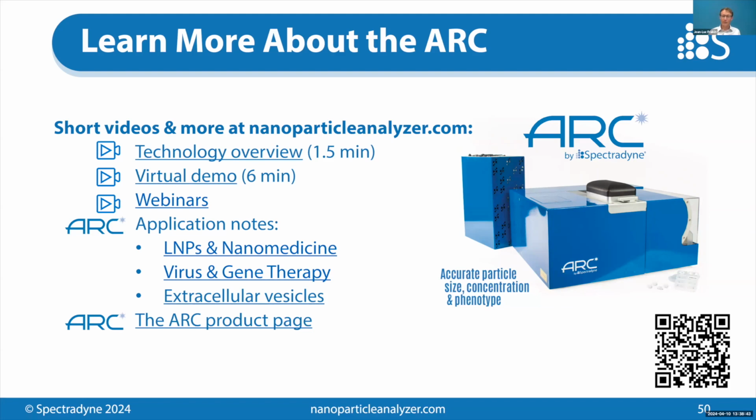Can we measure fluorescence at multiple wavelengths simultaneously? Yes, we can. And that's what I showed you in the bead example at the beginning. We also have examples where we can co-localize different colors on single particles, right, with immunostaining or different stains together. That's all possible on the ARC, just like you would on a flow cytometer, for example, right?